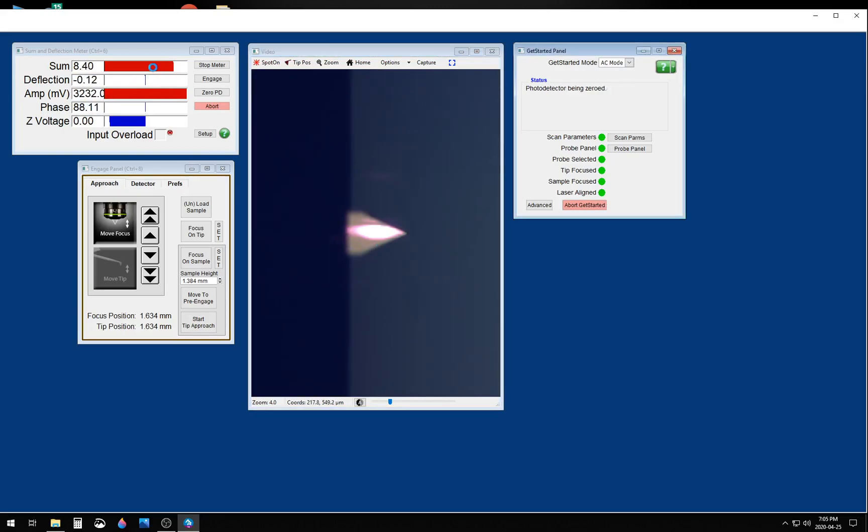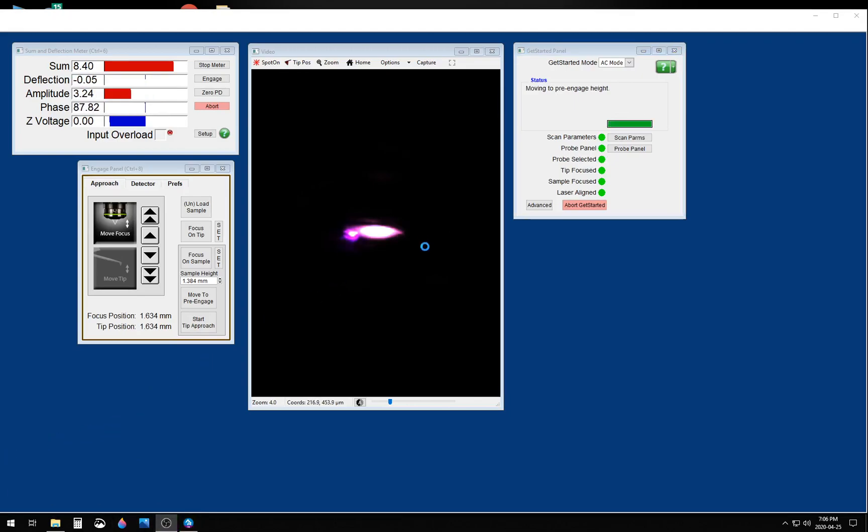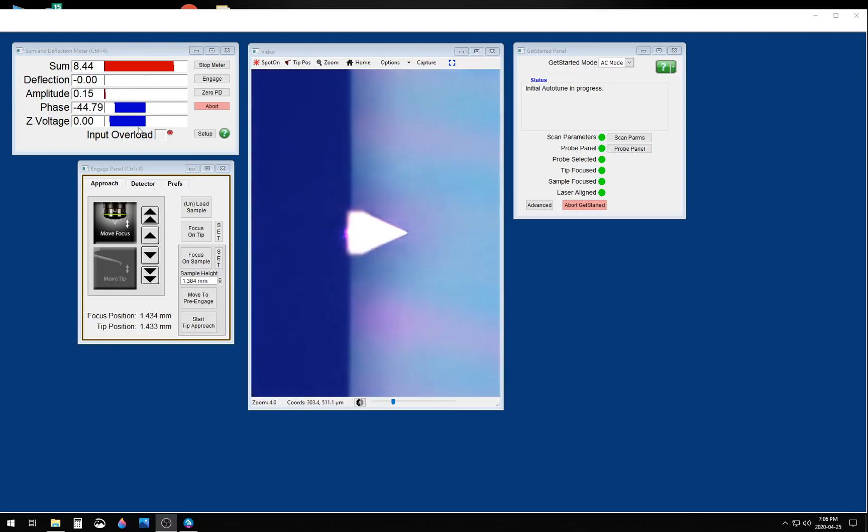The system takes over, it zeroes the deflection signal, and starts collecting information in order to calibrate the tip. Once it's done calibrating, it brings the tip close to the surface and tunes the cantilever.